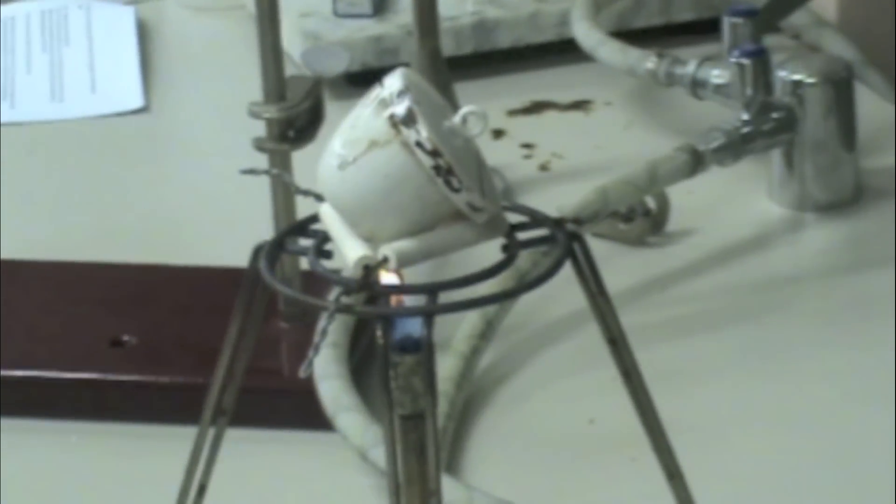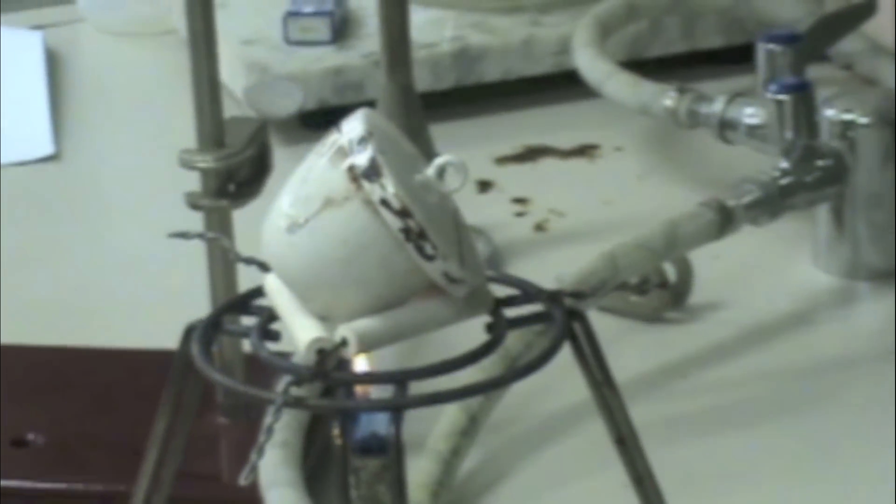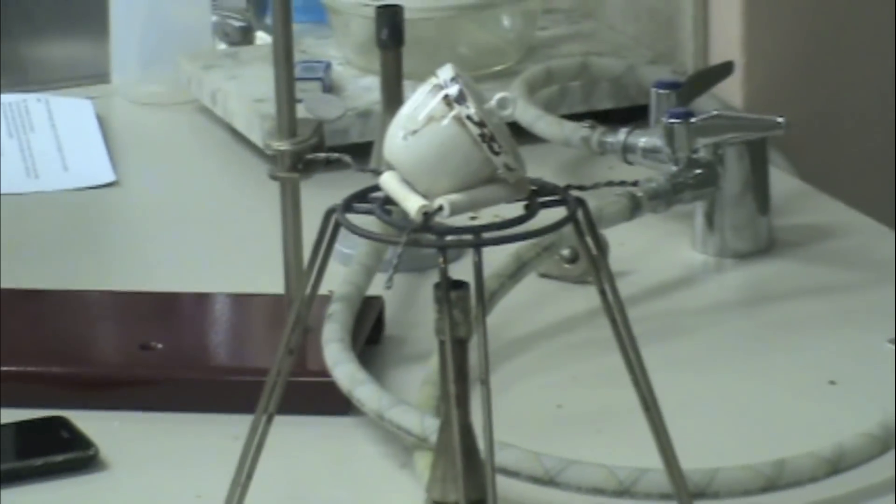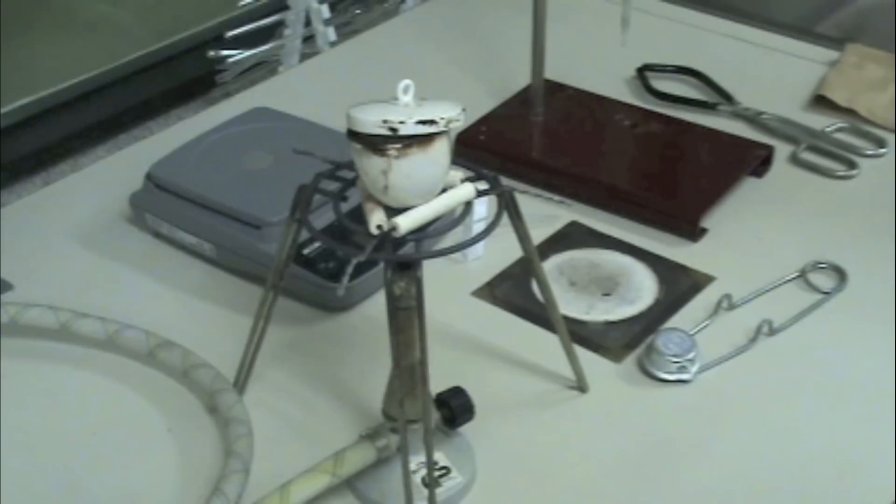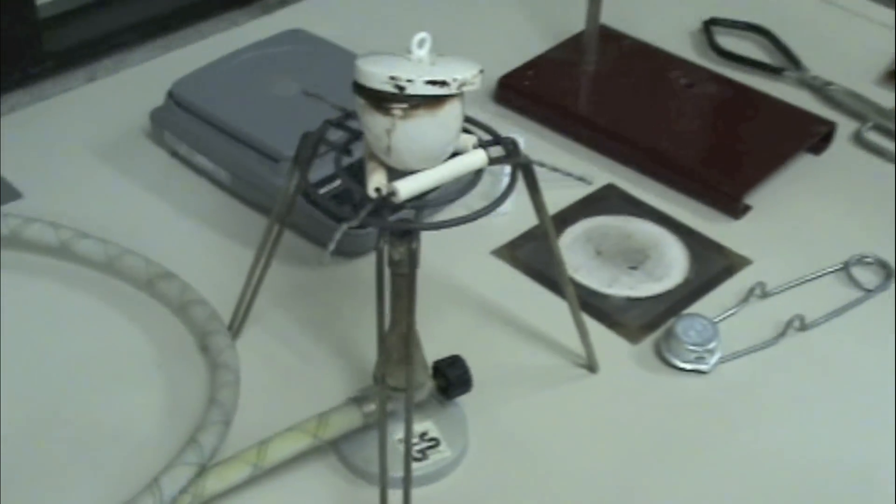So first, place the crucible and lid on a clay triangle and heat until red hot for about 5 minutes. Once the heating is complete, place the crucible on a clean wire gauze and let it cool to room temperature.